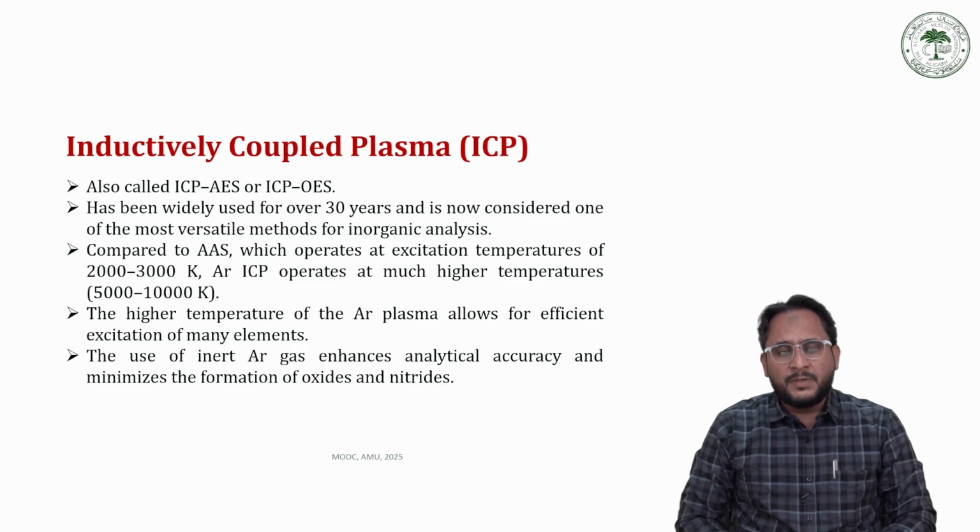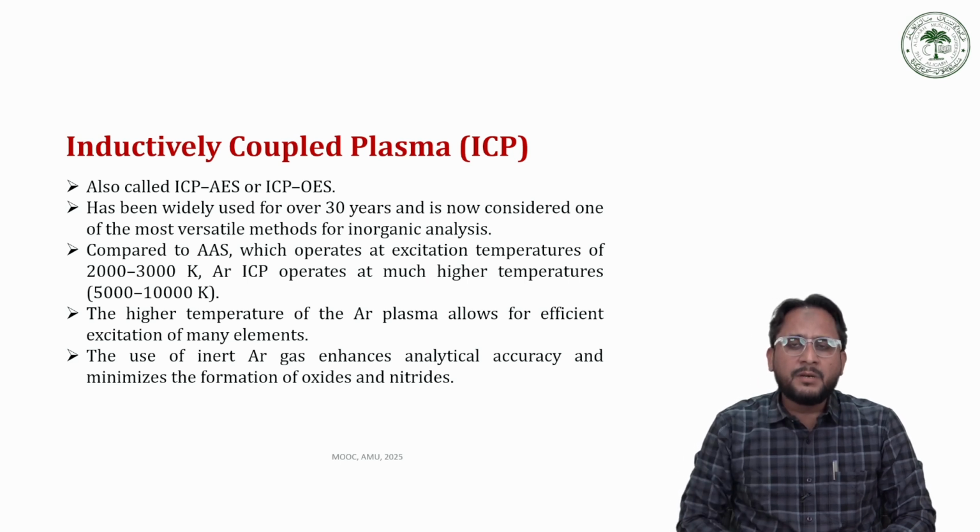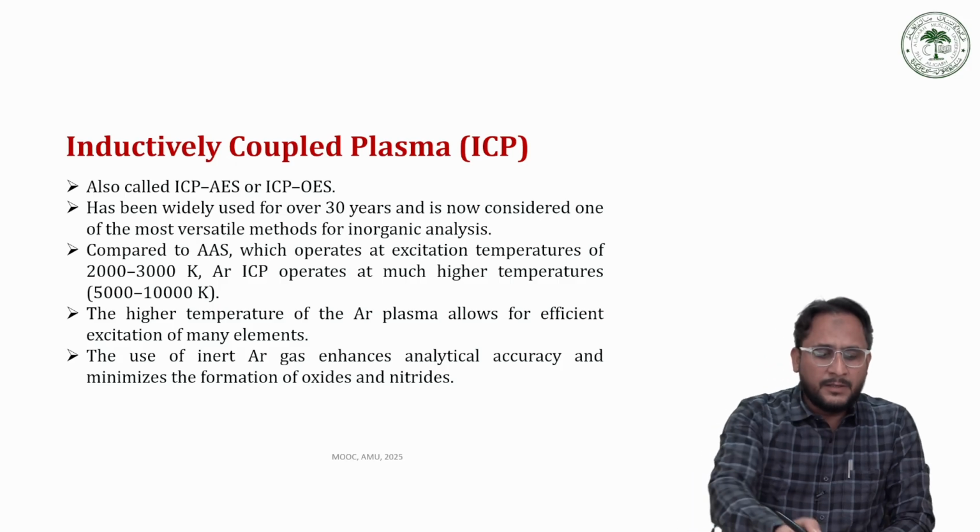The inductively coupled plasma technique, or the ICP technique, is coupled with an atomic emission spectroscopy technique and used as an excitation source.